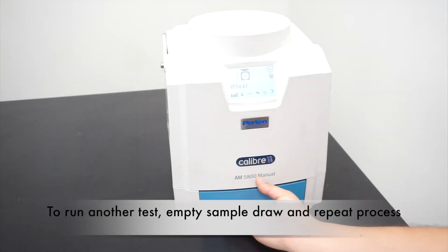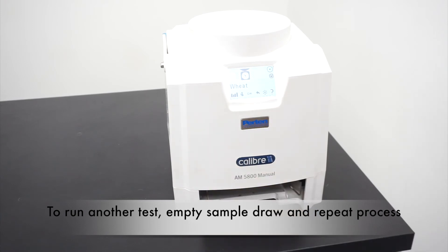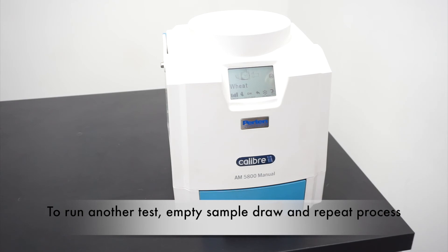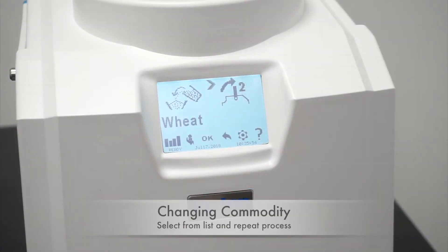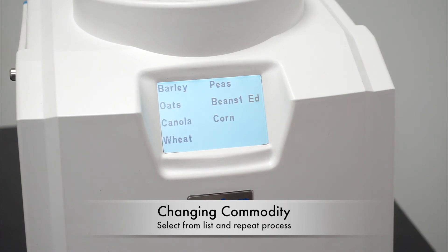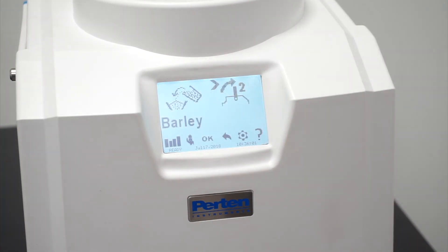To run your next test, empty the sample drawer and repeat the previous steps. To change the commodity, click on wheat and select from the list displayed.